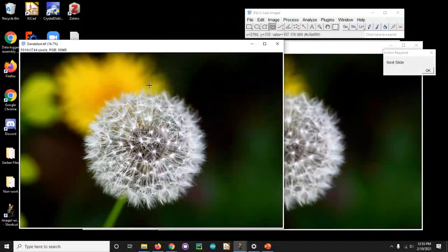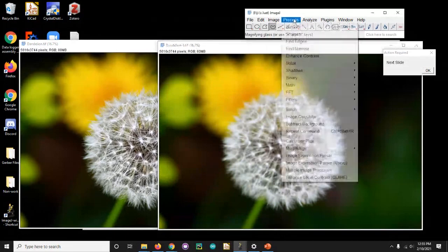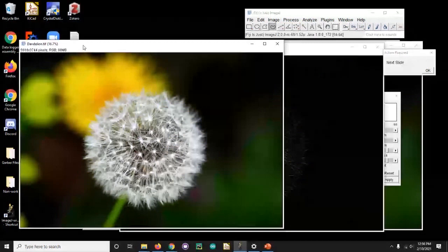By simply saying this image is the high frequency plus low, and this one is low, this image minus this image should give us only fluff. So we can go to image calculator, take our original image, subtract the blurred image, and boom. Something that would have taken years and years to do by hand, we just did almost instantaneously using Fourier space, because it's a trivial problem to solve in Fourier space. The reason it's trivial is because we had very sharp differences between the high frequency information we want to preserve and the low frequency information we want to remove.